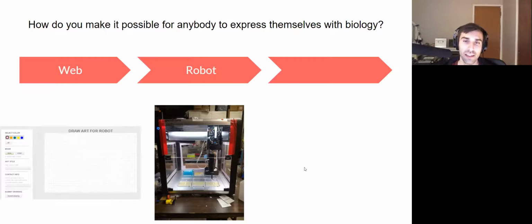And I'm really interested in something that Patrick actually suggested originally, but is some really great work by the people at the Free Genes Project and the Open Bioeconomy Lab, which is a set of 42 different reporter genes, one of which is here. This is a blue that is available for free through the Free Genes Project, and it's called the Open Reporters Project. So I would really like to get that in and start putting that into strains so that we can have a much broader palette. I don't know how many of those 42 would actually look interesting, but probably more than a few. 42 is quite a few, but it'd be really cool to have a 96 well plate just full of different colors so you can really do interesting stuff.